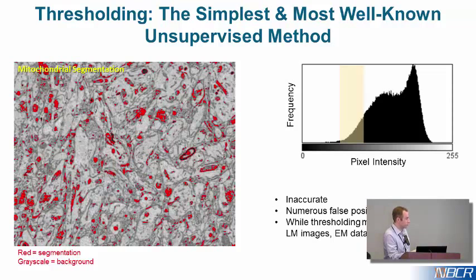So you could obviously never trust this without doing a lot of post-processing and, like I said, making those assumptions about what the mitochondria looks like in terms of shape and maybe trying to use some other algorithms to make it look better. But by the time you do that, you're going to spend a whole lot of time developing something that may very well only work for your exact data set and might not be scalable to other data sets or anatomical regions.